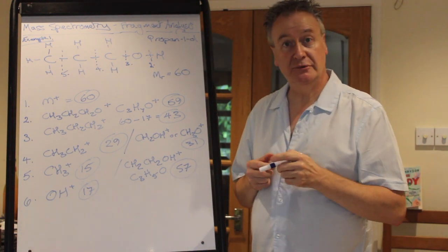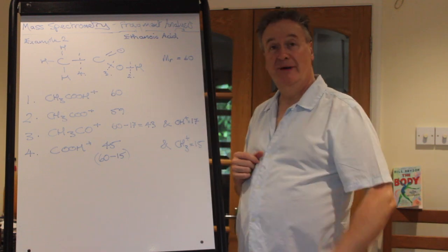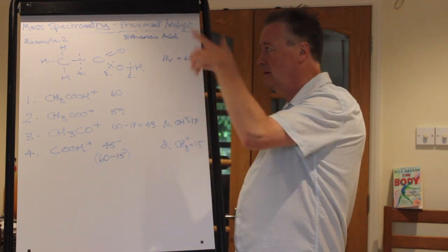I need to move on to example 2. I'll see you in a moment. So here we are with the second example. Same formula mass, 60, different compound, ethanoic acid, carboxylic acid, vinegar.